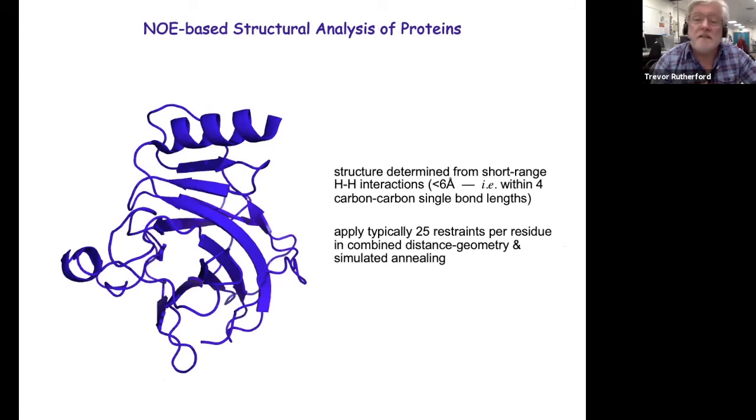Nuclear Overhauser effect, then, it comes really from the 1980s. It was spearheaded from the 1980s by Kurt Wüthrich's lab in Zurich.